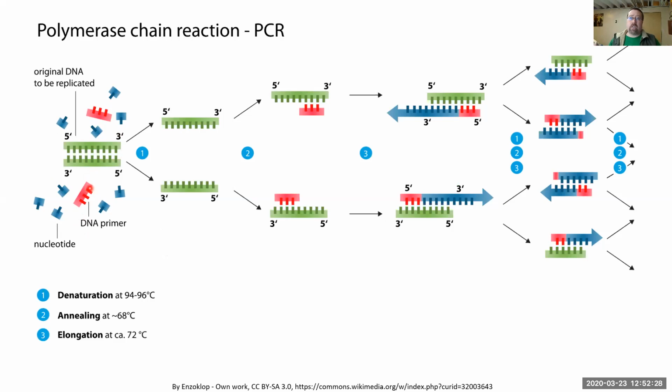Okay, not the whole viral genome, just one section of it that is specific for not only coronaviruses, because there's a number of circulating pneumonia-causing coronaviruses that show up once in a while, actually seasonally, like coronavirus betas. Those are common in the hospitals, but they don't spread like what we're seeing with this coronavirus. And so this will be specific not only for coronaviruses, but for the COVID-19, which is why we needed to get that from the CDC.